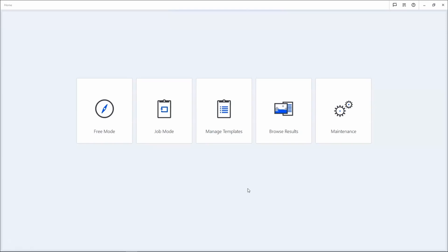I'm showing you how to set up a XenConnect project and get started with project-based imaging in XenCore. To get started we will enter the free mode within the XenCore.